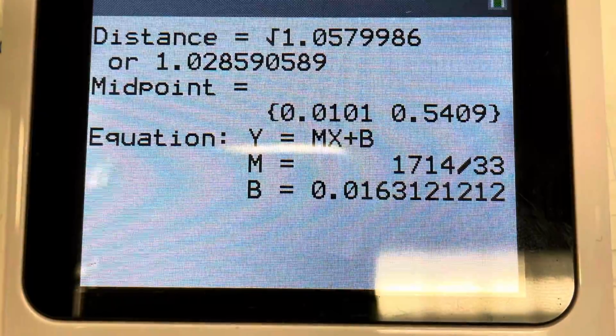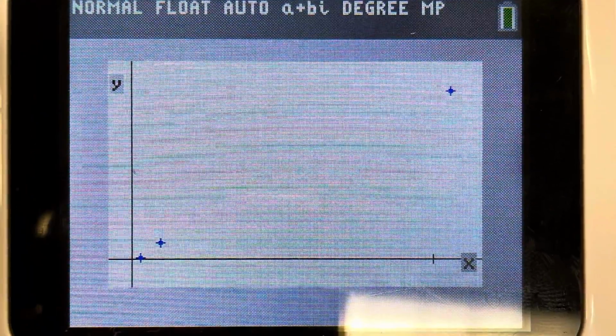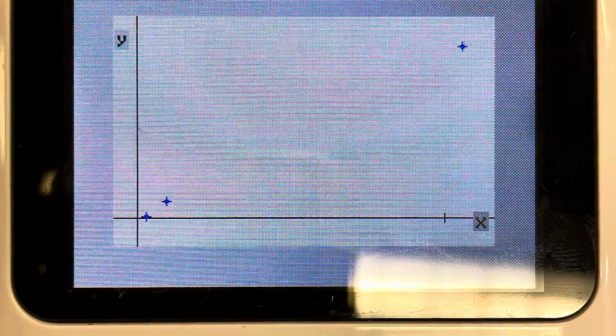Then we went to create the following graph and noted the relationship between absorbency and concentration, noting that when the absorbency is low, the concentration of the solution is also low. When the concentration of the solution is high, then the absorbency value will be high.